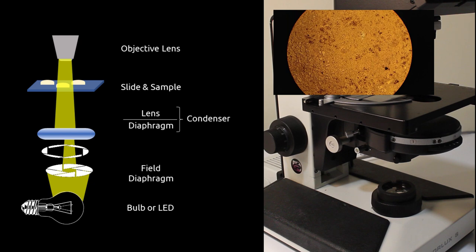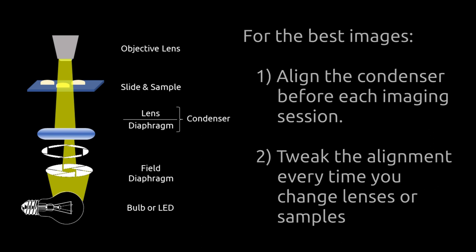Congratulations, you've now aligned your condenser. That said, for the best images you should actually tweak this every time you change magnification.